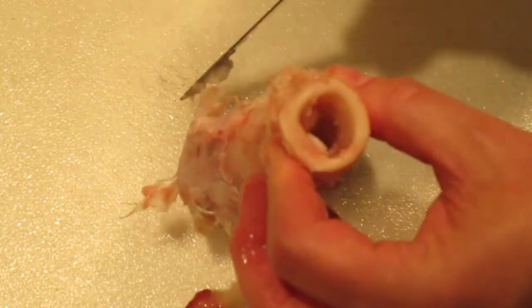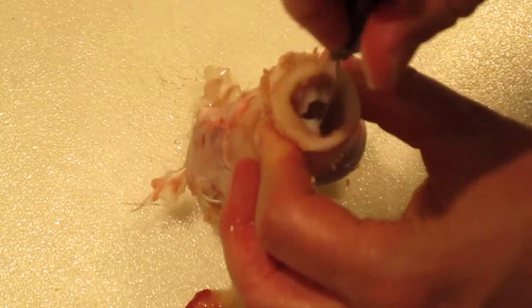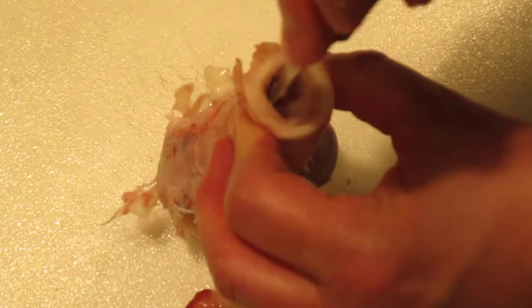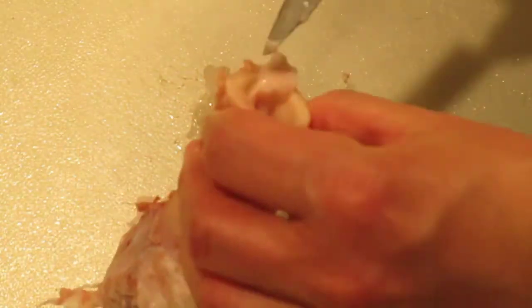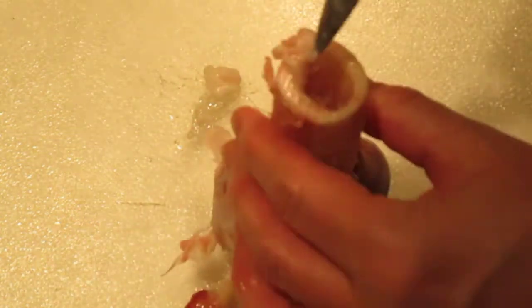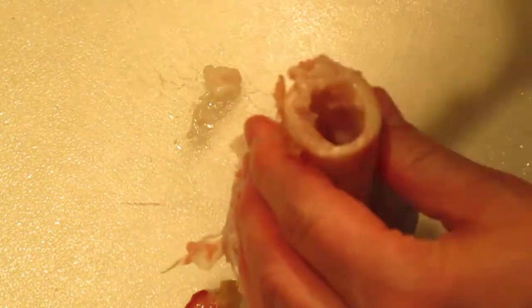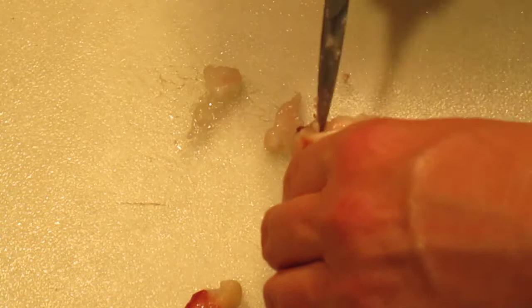I can actually reach down there and feel the spongy bone. I'm going to pull out some more of this yellow marrow and see if we can see down into that cavity so we can see a little bit of the spongy bone way down in there.